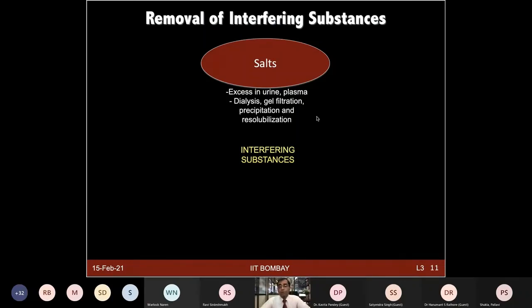And if you are going to plan your two-dimensional electrophoresis type of experiment, this is going to be quite crucial, because your IPG strip, or immobilized pH gradient strip, will stop processing your sample for the isoelectric focusing to happen, because so much voltage will rise and then go to stop, and as a result the sample can't move in the electric field. So that is one of the important things to consider if you are planning a two-dimensional electrophoresis experiment. Or even if you're thinking about directly doing shotgun proteomics using an LC-MS based approach, think about that.